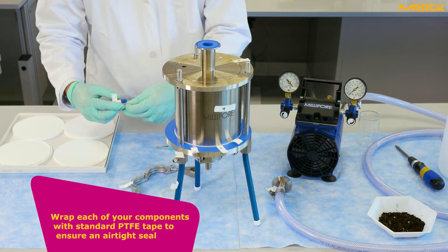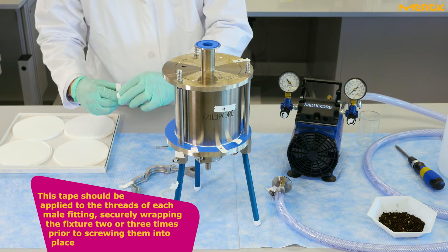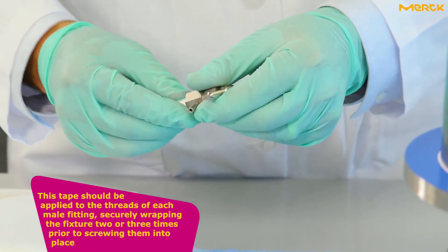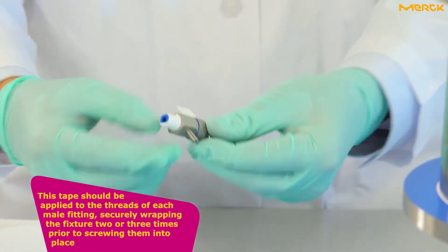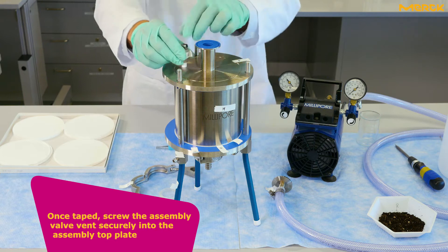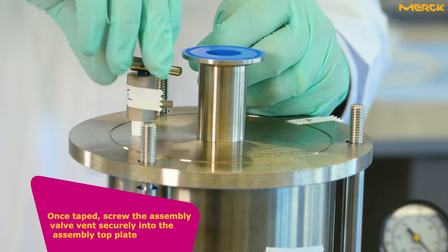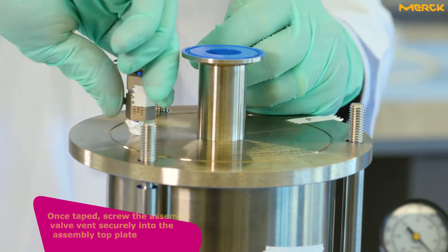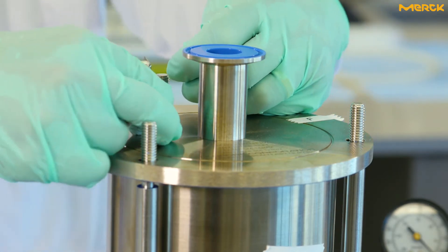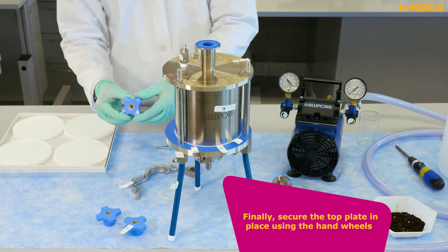This is the filtration assembly valve vent — it assists in releasing pressure from the assembly. Wrap each of your components with standard PTFE tape to ensure an airtight seal. This tape should be applied to the threads of each male fitting, securely wrapping the fixture two or three times prior to screwing them into place. Once taped, screw the assembly valve vent securely into the assembly top plate. Finally, secure the top plate in place using the hand wheels.